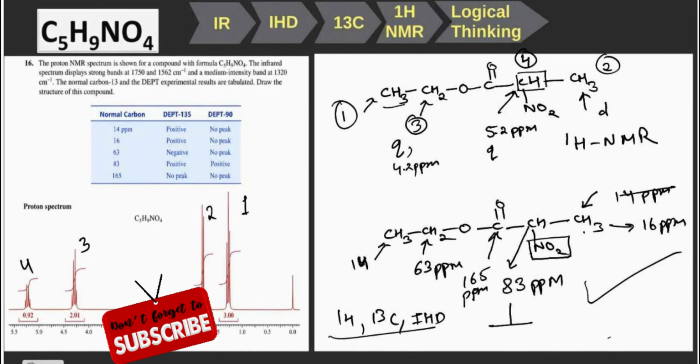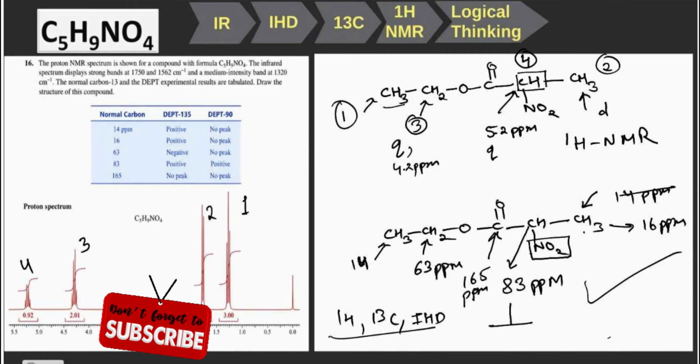I hope you really liked this NMR problem, and you must have understood that knowledge of chemical shift values plays a very crucial role in determining the structure of an organic compound.